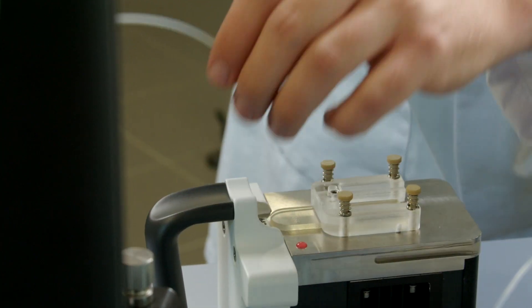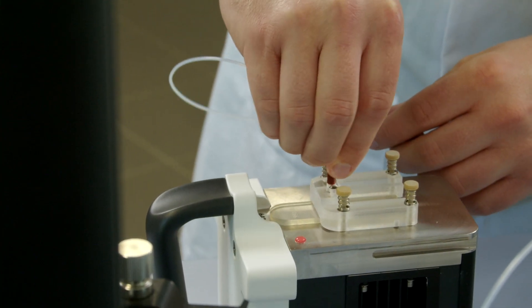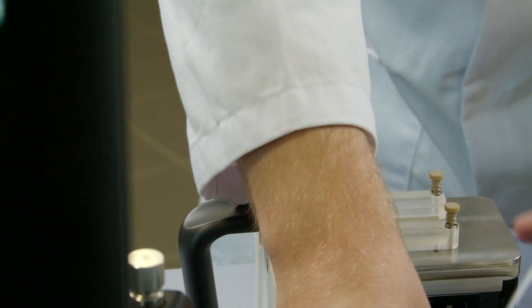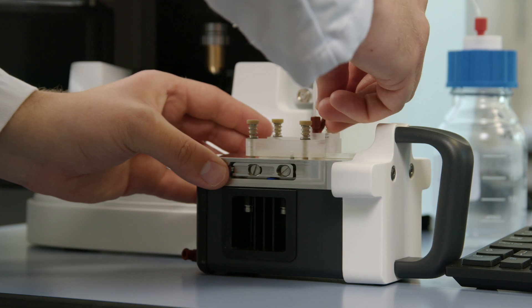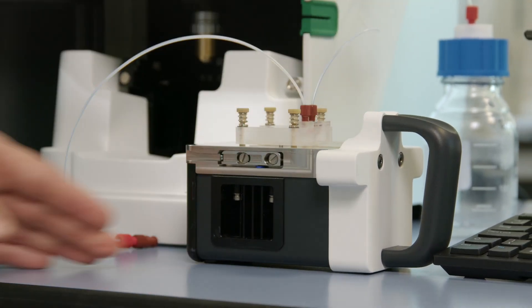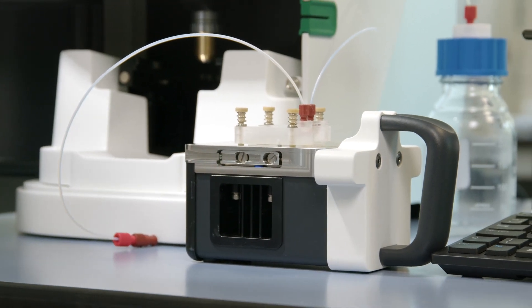Once we've got our screws in we can now put in the inlet tube which the sample will go into the measurement window through. And then finally our outlet tube which the waste will go out through. Now our laser module is ready for the sample.